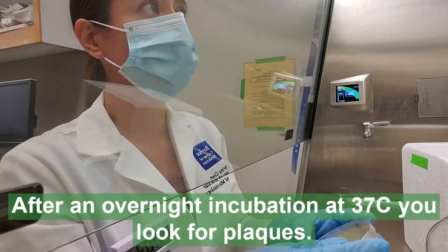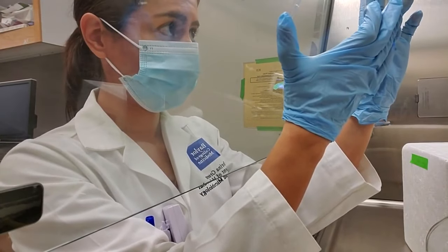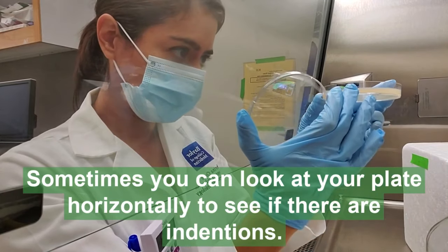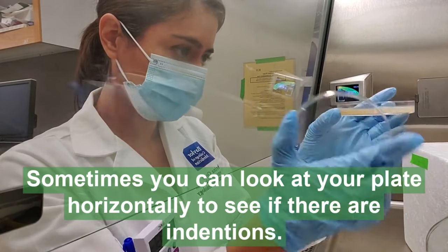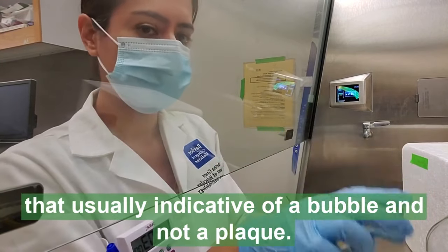After an overnight incubation at 37°C, you look for plaques. Sometimes you can look at your plate horizontally to see if there are indentations — that's usually indicative of a bubble and not a plaque.